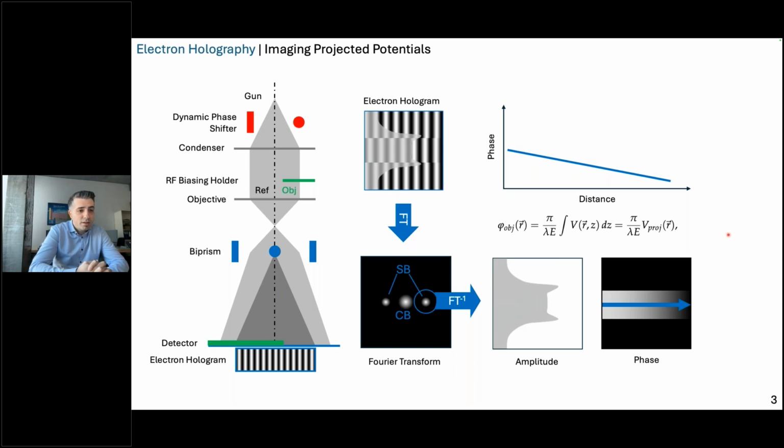So first suspect is we can use a pulsed illumination, like a stroboscopic illumination or a photoemitter, like everyone else does. The problem is, if we just think about it, we are pulsing the whole microscope, so also the specimen. This means within the pulse, there will be some charging effects of the surface, and these surface charges will have a dynamic, so a transient time. The transient time is, of course, in the same time scale as the process I want to investigate, the dynamic of charge carriers within the material. So constantly charging and discharging the surface of my specimen will produce a lot of problems.